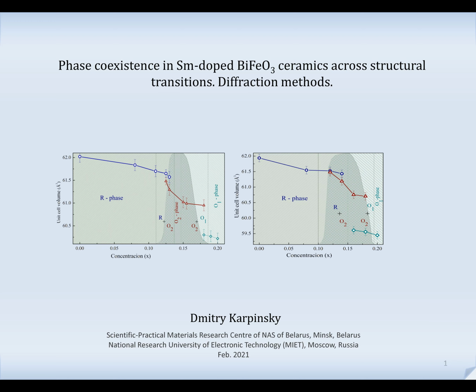So the presentation consists of two parts. First, about diffraction of X-ray, synchrotron, neutrons. And the second part is my original research, which is still under study. I will deliver some results.